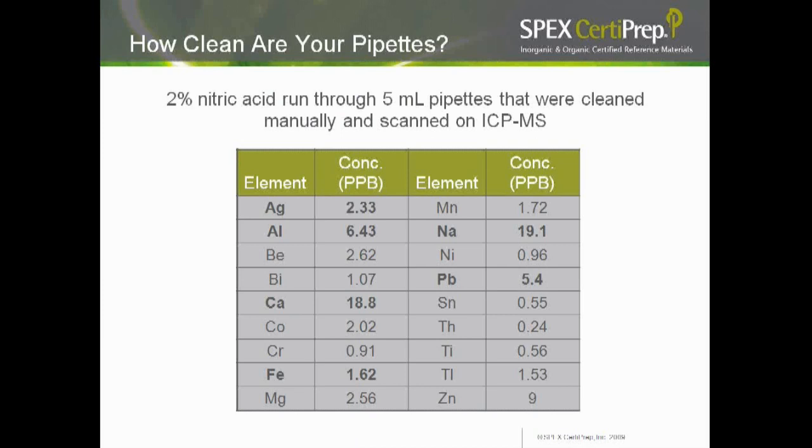Usually, pipettes have memory effect. Remnants of what you pipetted before will show up in later use even after thorough cleaning. Hence, the process of cleaning is very critical.